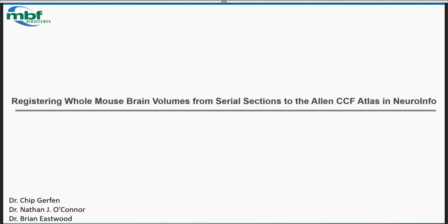I do want to remind people that this is one in a series of webinars about this topic of mapping brain volumes into an atlas reference space. Our last couple were really general overviews, and they're available on the MBF website, under resources. I'll give an address at the end too. But this one, we're going to run through a certain part of the workflow. So we're going to do a deep dive here.